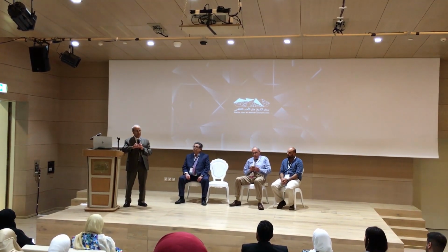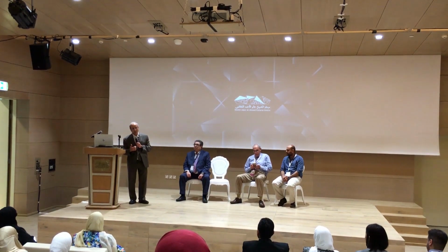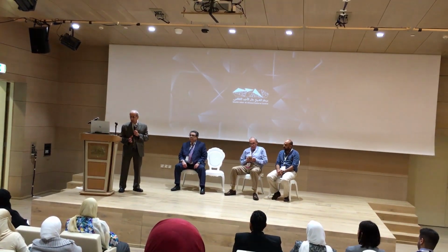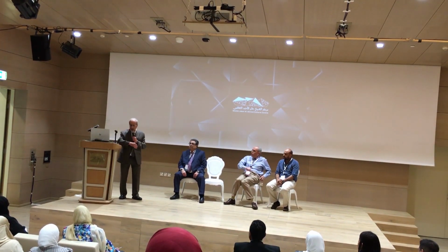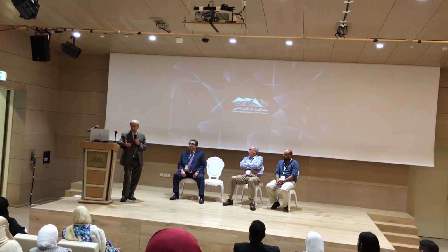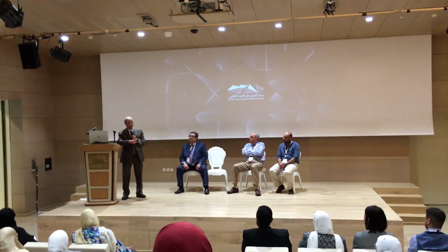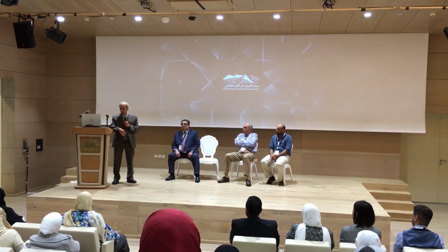So the team leader then gets a whole inspection package from CAP. The package will include your data, all your details, your menu, your tests, your QC, whatever you have been doing. So in this case, the simulation which we are going to do assumes that I was chosen as a team leader by the commissioner. So I get the package for Kuwaiti National Hospital, let's say. And I look at the data.